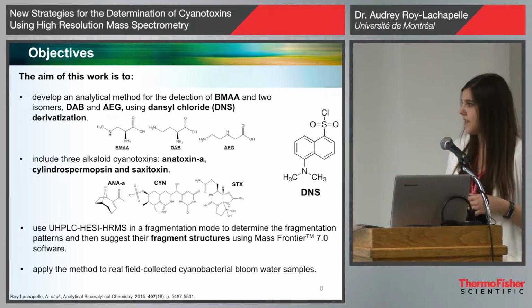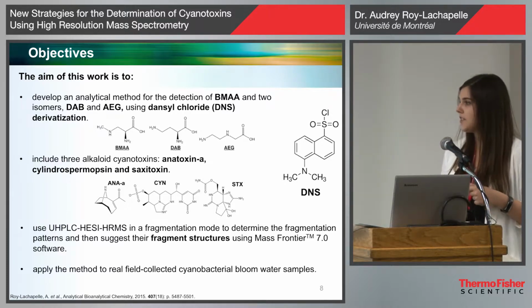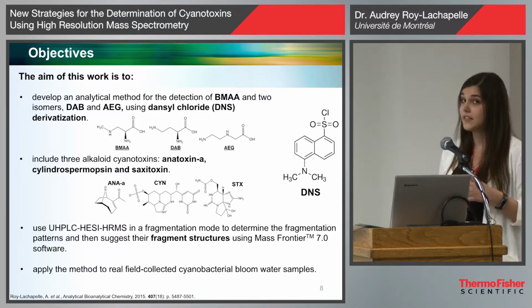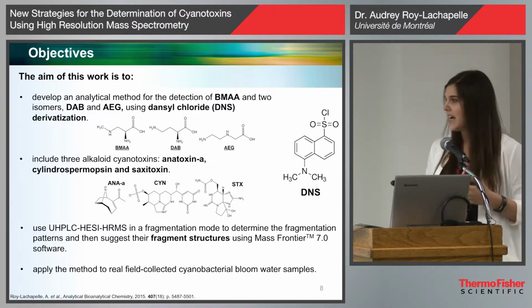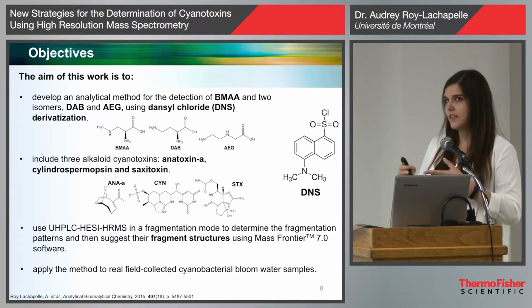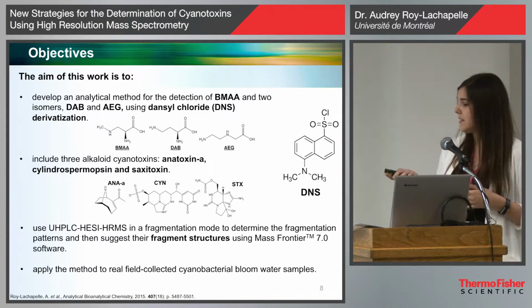We used the Q Exactive for high-resolution detection, and also to determine the fragmentation pattern, because since we are using a derivatization and we don't really know what fragments we are going to have in the analysis, we wanted to be more specific and really study the fragments that we would have with this derivatization.